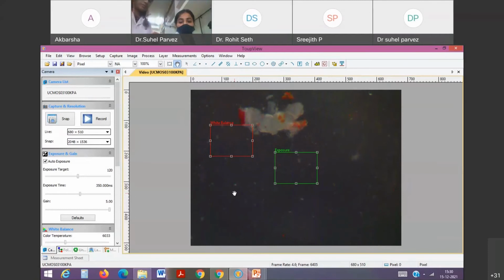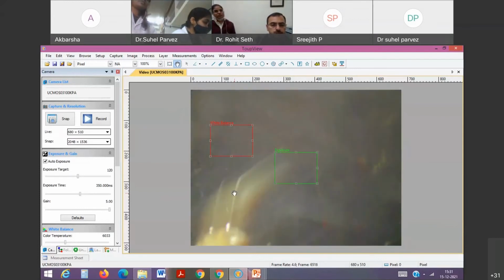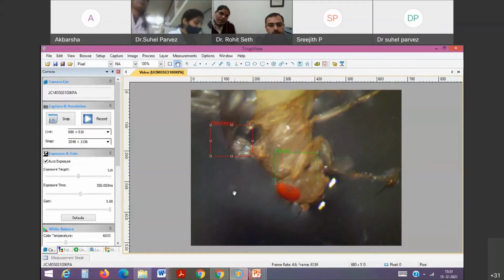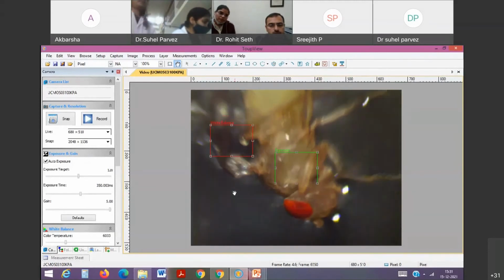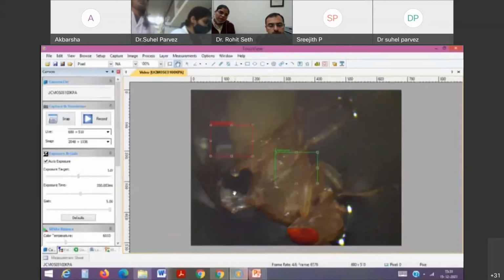How many flies are needed for the isolation part, at least? For one sample, we take around 100 fly brains for the experiment. In general, we use the crude protein part: we dissect out the heads, homogenize with the buffer, take the supernatant, and use that sample for protein. For the mitochondrial dysfunction study, we dissect out around 100 brains, isolate the mitochondria from the fly brain, and then perform experiments related to oxidative stress, MMP, mitochondrial membrane potential, etc.